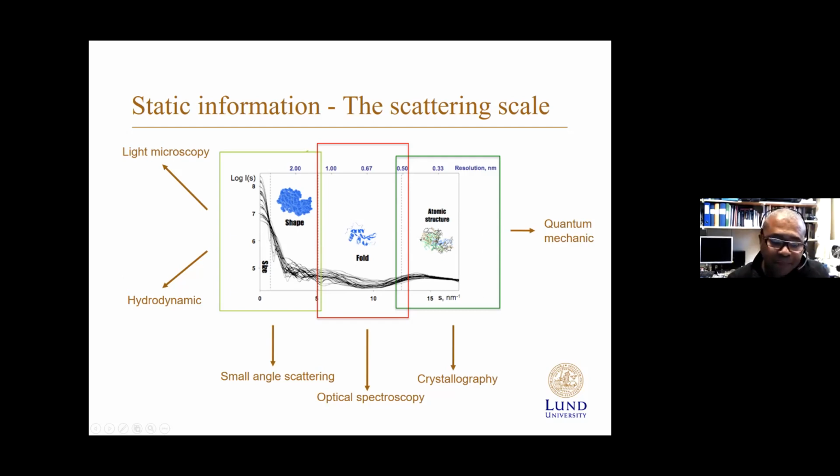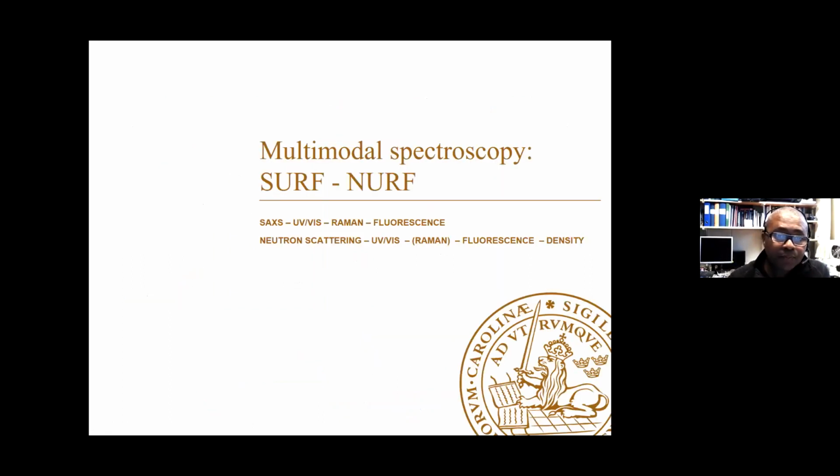So our idea was then, can we use just this side of the static information, by mixing small angle scattering and optical spectroscopy, to try to resolve those particular interactions. And this is how the multimodal spectroscopy adventure started.